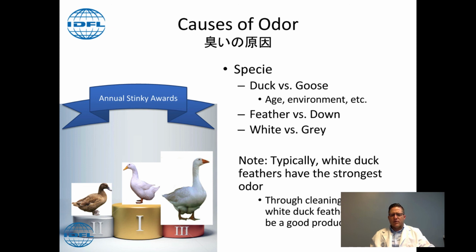White duck feathers, however, regardless of how fragrant the sample can be, generally through correct processing and cleansing of the sample, the odor should dissipate quite significantly.